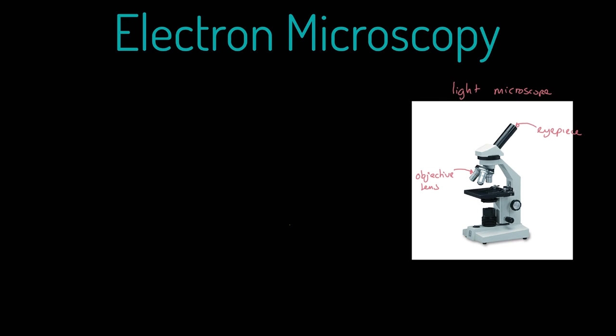Now, this little feature here, where we place the specimen, this is what we call the stage. That would be good for you to have an awareness of. And what we place the specimen on, or literally slide in and place here, is the slide. So our specimen is going to sit on that glass or perspex slide and be viewable by us.